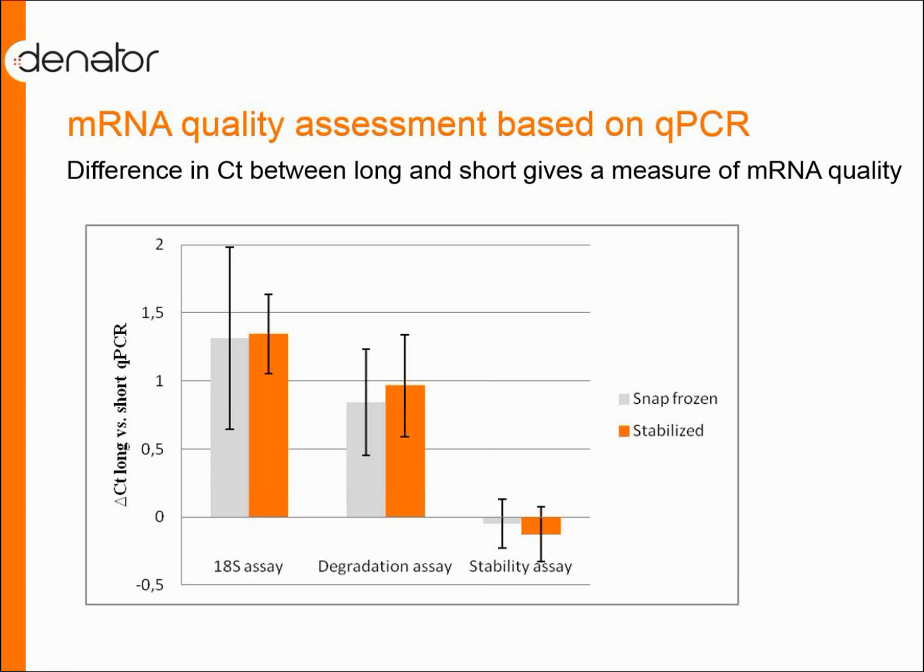So to summarize the RNA story, I would say that RNA-based analysis is possible, but there is no stabilizing effect. So it's important to use some other type of combination stabilization, if it's needed to stabilize the mRNA as well.